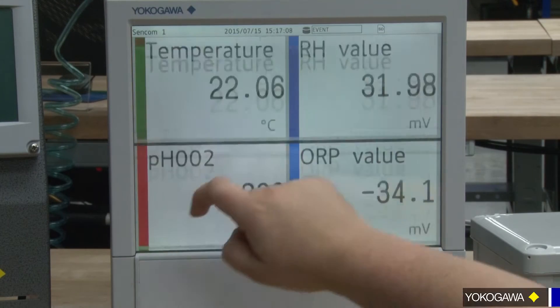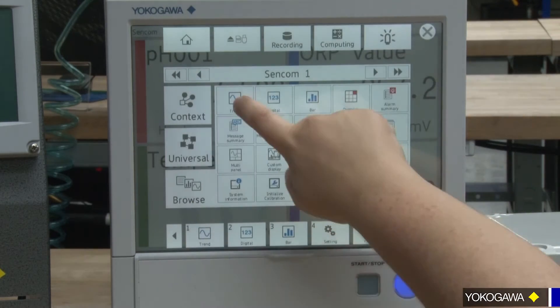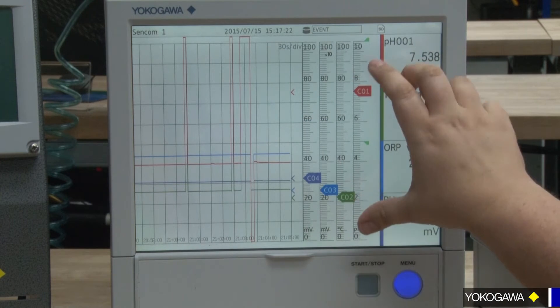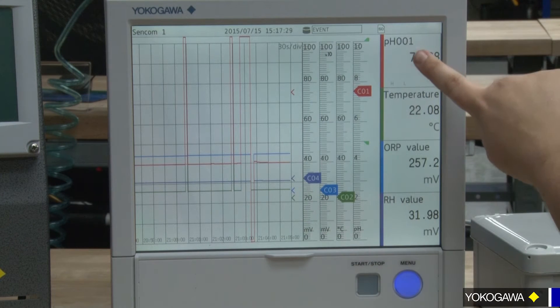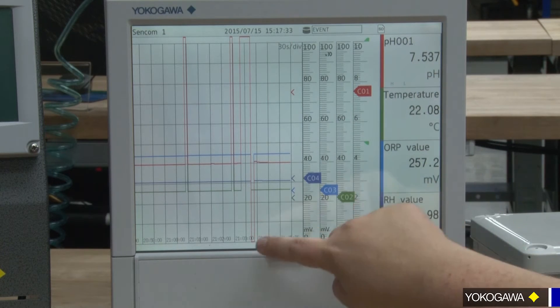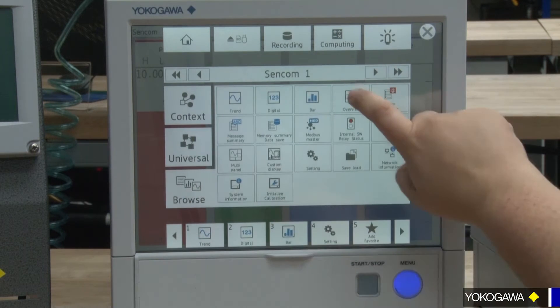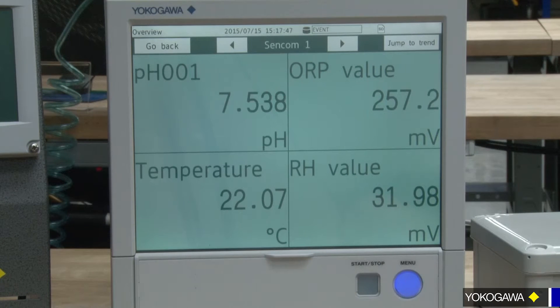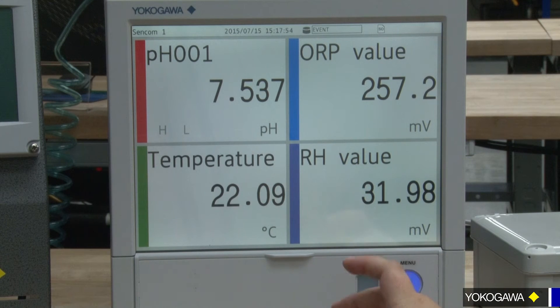With the GX, you have a digital display or a trend graph that you can see, and you can set these ranges. So if you're only interested in between seven and nine pH, you can shrink it, and each color code on the trend graph here matches the color code for what it's reading. You can set these ranges so it's not just a straight flat line. You can also look at it as bar graphs, or you can have a generic overview of the four sensors. These are more custom graphics — if you don't like the traditional white background and black lettering, you can do others if your lighting needs it.